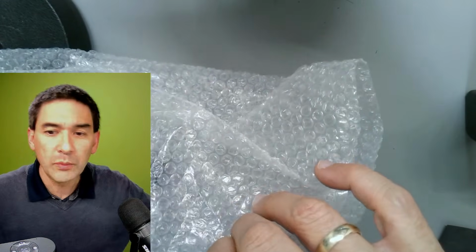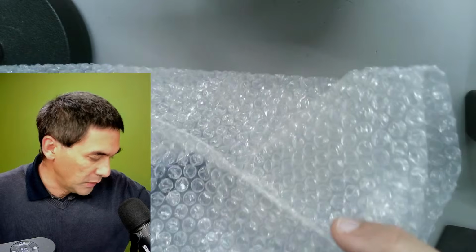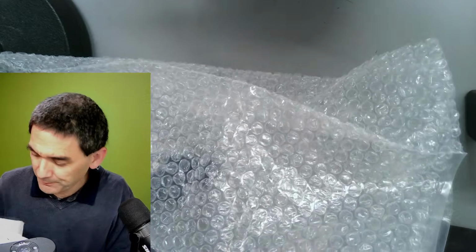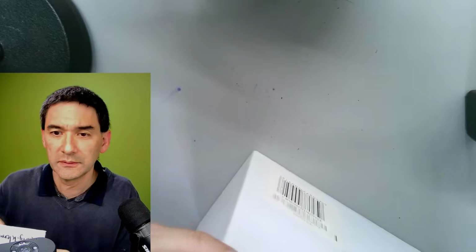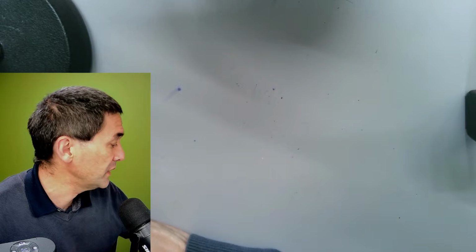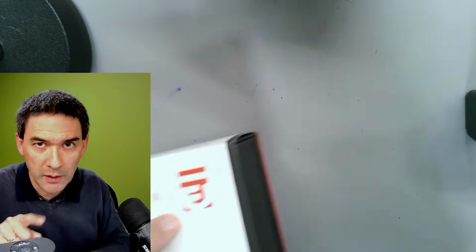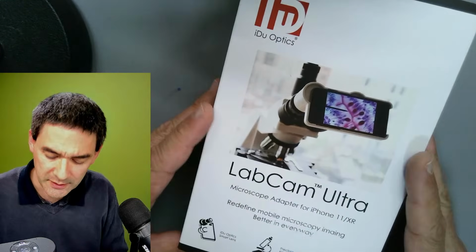Then, last but not least, I want to show you one for an iPhone. Let me put everything away here. Unfortunately, that's an expensive one. I made a review video of this, so if you check the links below, I put a couple of links to a couple of videos. This is how it looks.